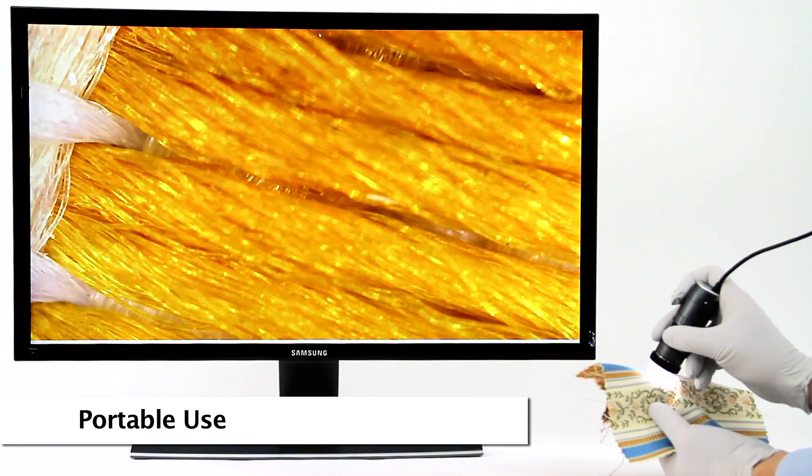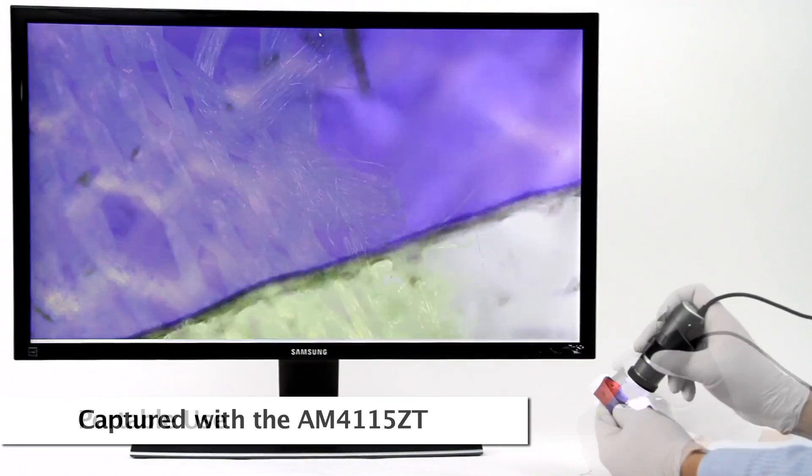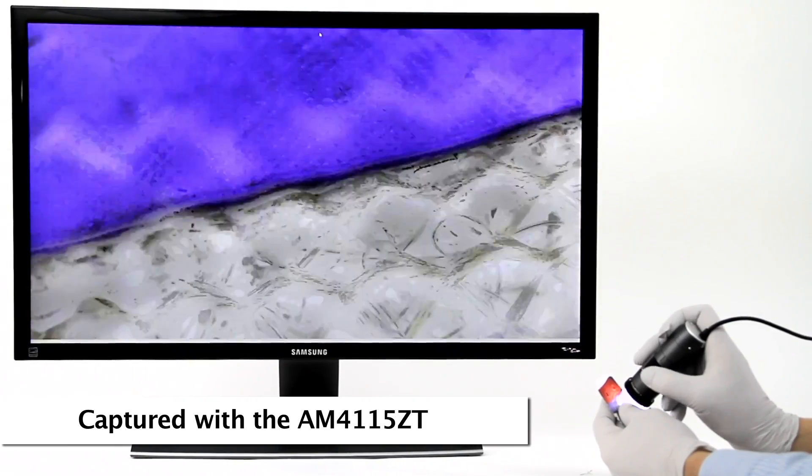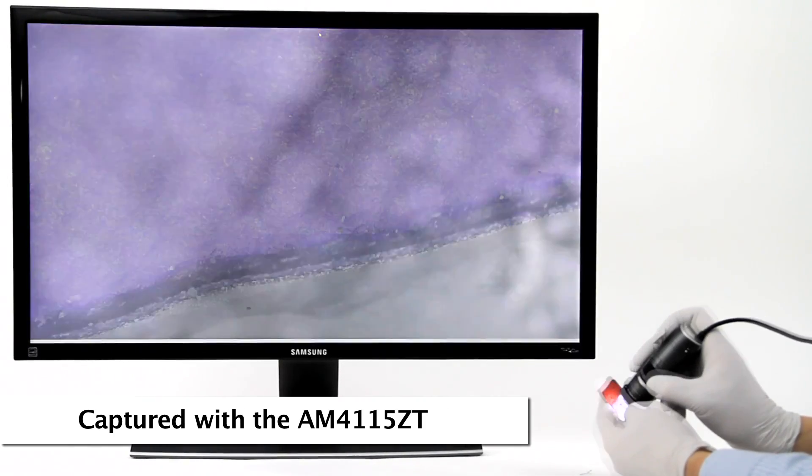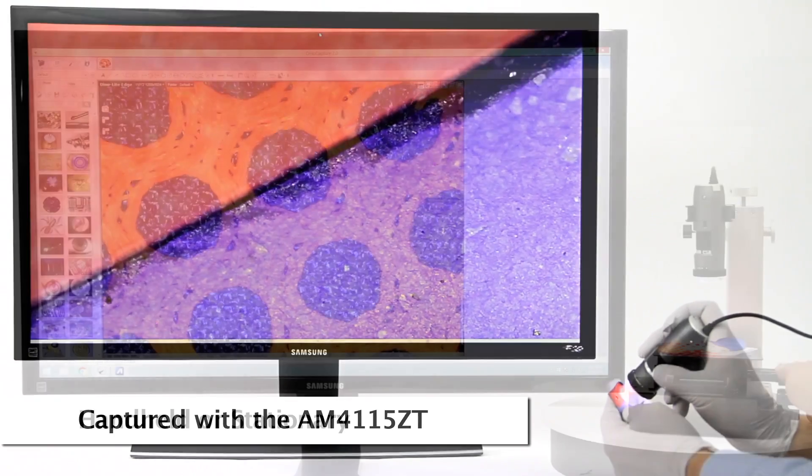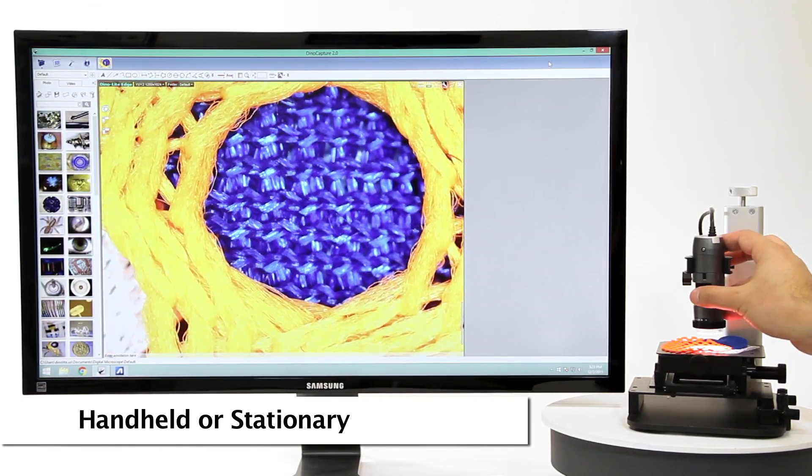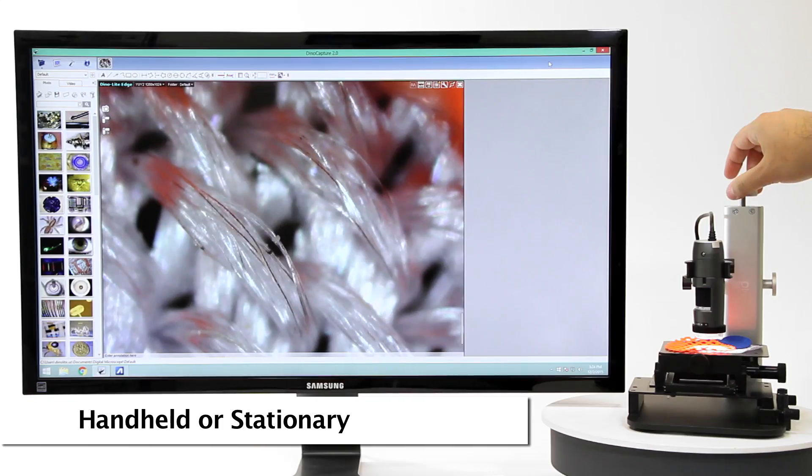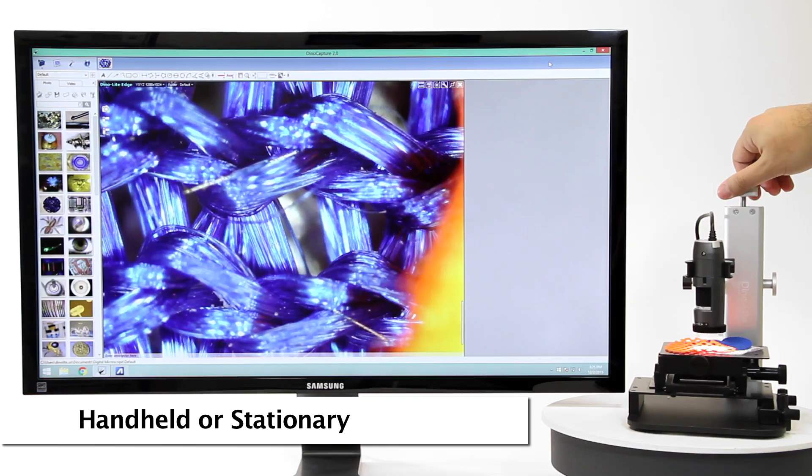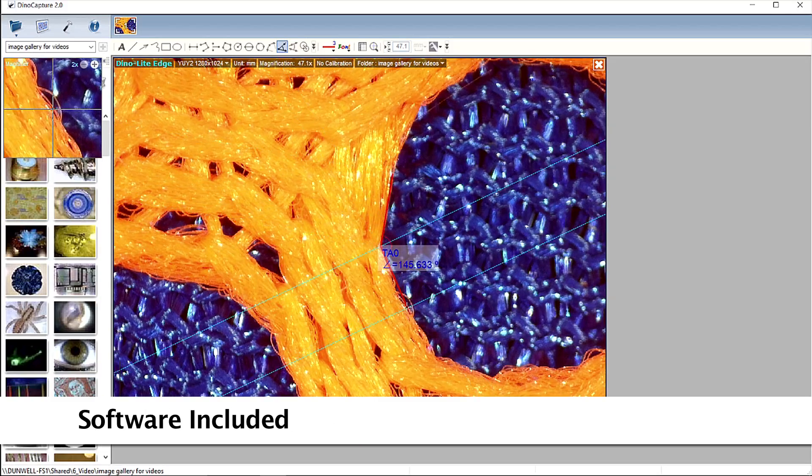The Dynolite is a handheld microscope camera with most standard models going up to 220 times magnification. These models are connected to a computer via USB and include easy to use software that allows users to capture images and video as well as many other basic and advanced features.